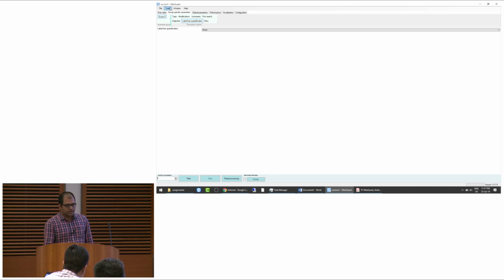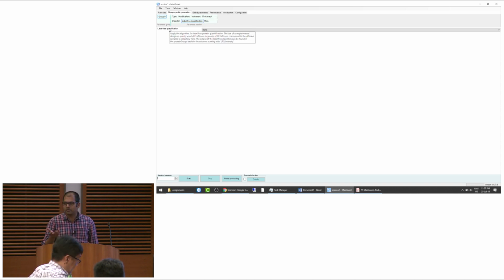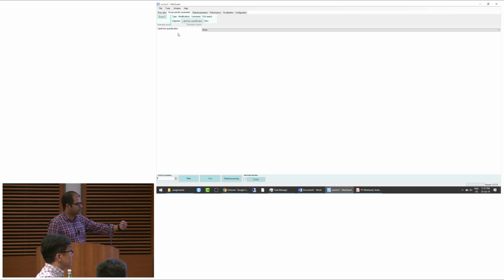I don't know how the calculation is, but anyways, the proteome is not going to change in 5-10 minutes. I don't know. You need to have matched samples. So you actually need to have matched samples for proteome also at different time points, the very short time points. Every single time point has to have both proteome as well as phosphoproteome files. But can you just take the same proteome and then fake it? Or copy the raw files, yeah. Yeah.